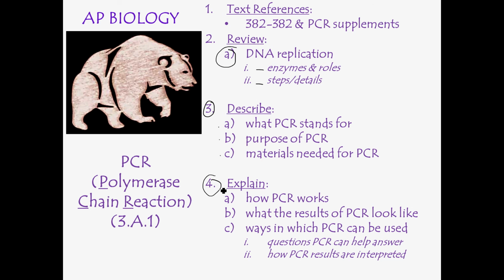But then really down here, you're trying to explain how PCR works, what the results of the PCR are going to look like, and then most importantly, ways in which PCR can be used, right? So what kind of questions can PCR be used to help answer, and then how do you actually interpret the results of the PCR reaction?